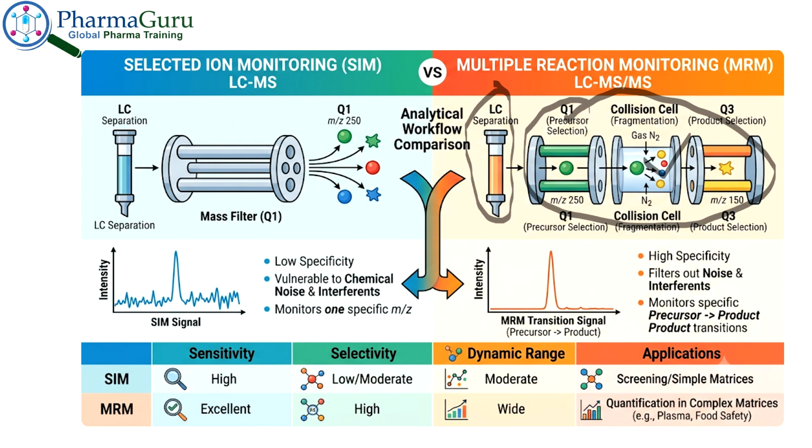In this session, I will discuss what is SIM, what is MRM, what is the difference between SIM and MRM with respect to sensitivity, selectivity, dynamic range, and application. I will also discuss which mode you should use.